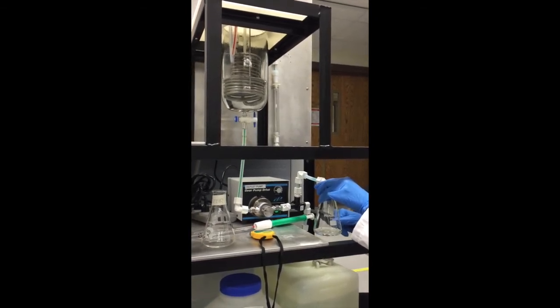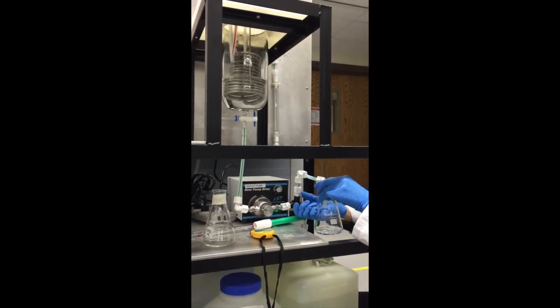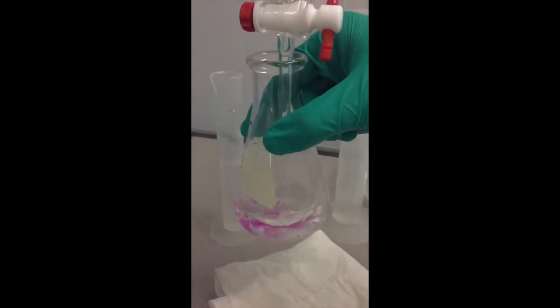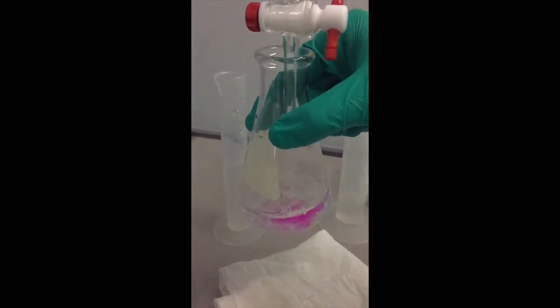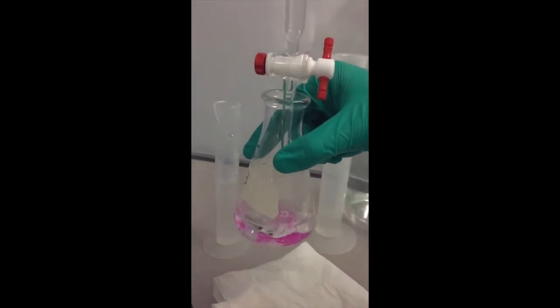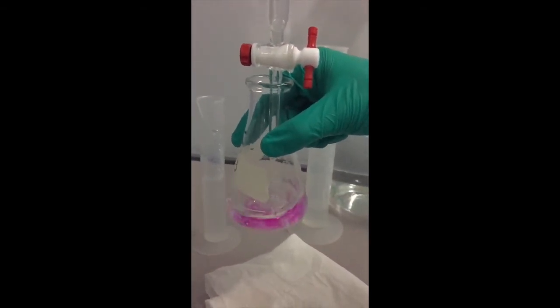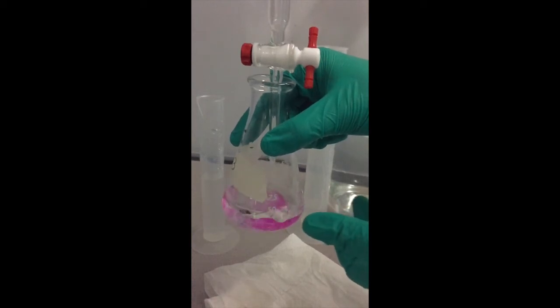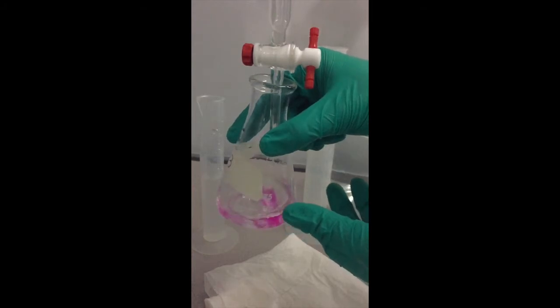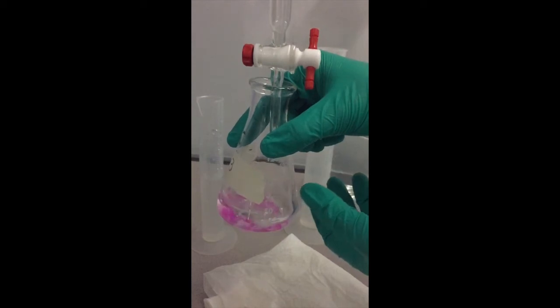In order to obtain accurate data, pipette 3 samples at 1, 3, 5, and 7 minutes after mixing the reagents. Once the sample is pipetted at the designated time intervals, quickly titrate the sample with 0.1 molar sodium hydroxide solution. Repeat the process for 3, 5, and 7 minutes of time interval and record the volume of titration needed. Subsequently, graph the data and the calculation results in MATLAB in order to obtain the rate constant for the CSTR experiment.